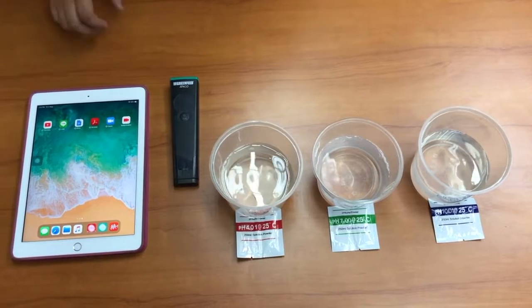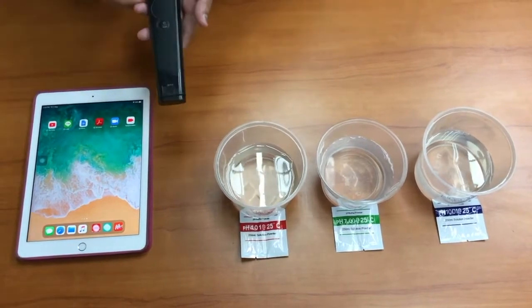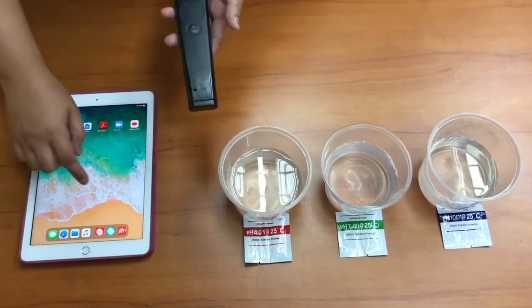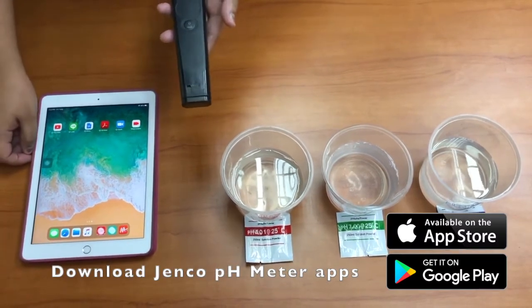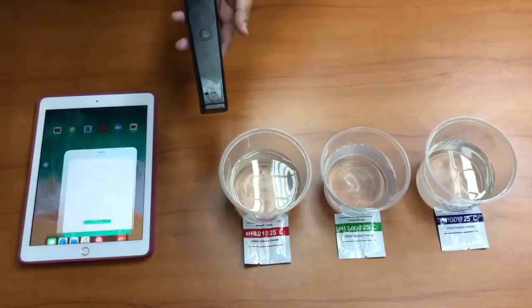Hello, today I'm going to show you how to use this pH Jenco meter. Before that, you have to download the pH Jenco apps in Google Play Store or App Store. Now we start the apps.